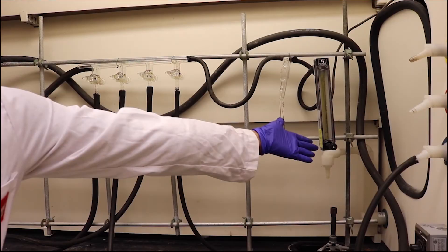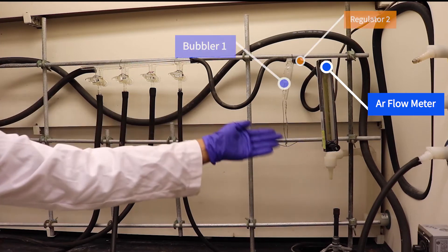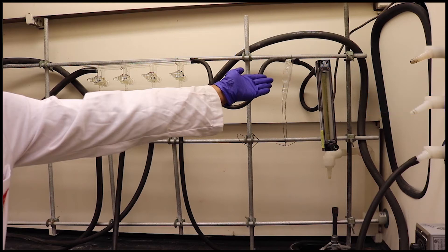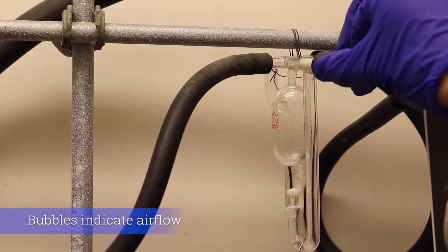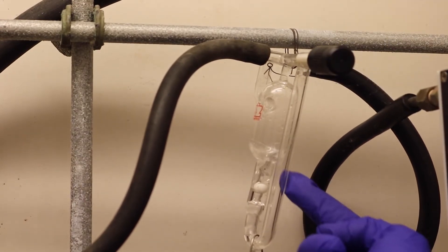The argon gas will first travel from the tank to the manifold hood through the thin built-in line. It will then move to the argon flow meter and then the bubbler. If the gas successfully passes both pieces of equipment, it will proceed to the manifold. Adjust regulator 1 until the reading of the argon flow meter is between 3 and 4. Bubbles should be present in the bubbler when turning regulator 2, which will indicate that the gas is flowing.